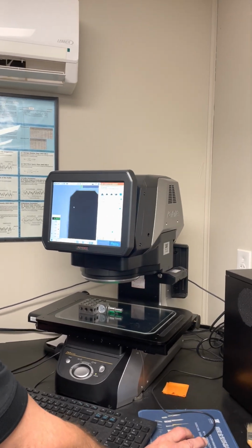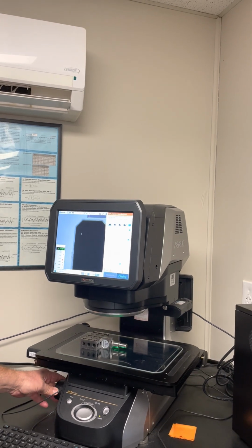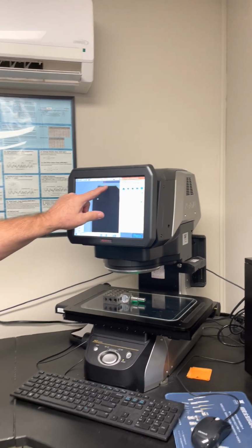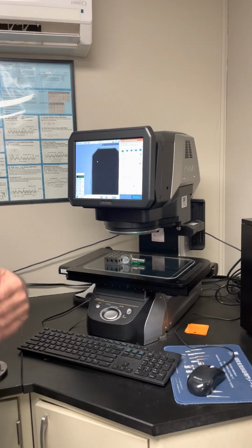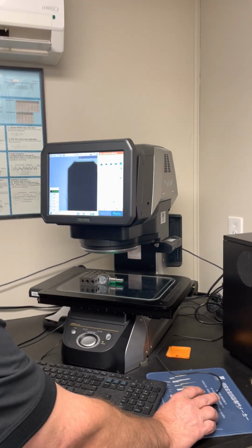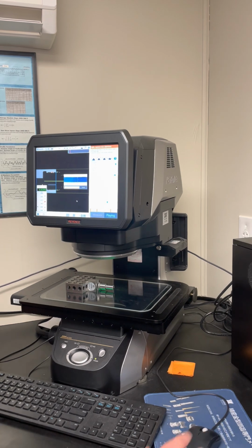So now I'm up here. Like I said, what I want to do is focus in on that edge as best I can. So you'll see that's a pretty sharp edge. But you'll notice that they seem out of focus now, which is okay because when you run the program, it's automatically going to change that focus for you. So I'm going to start here and say the capture.